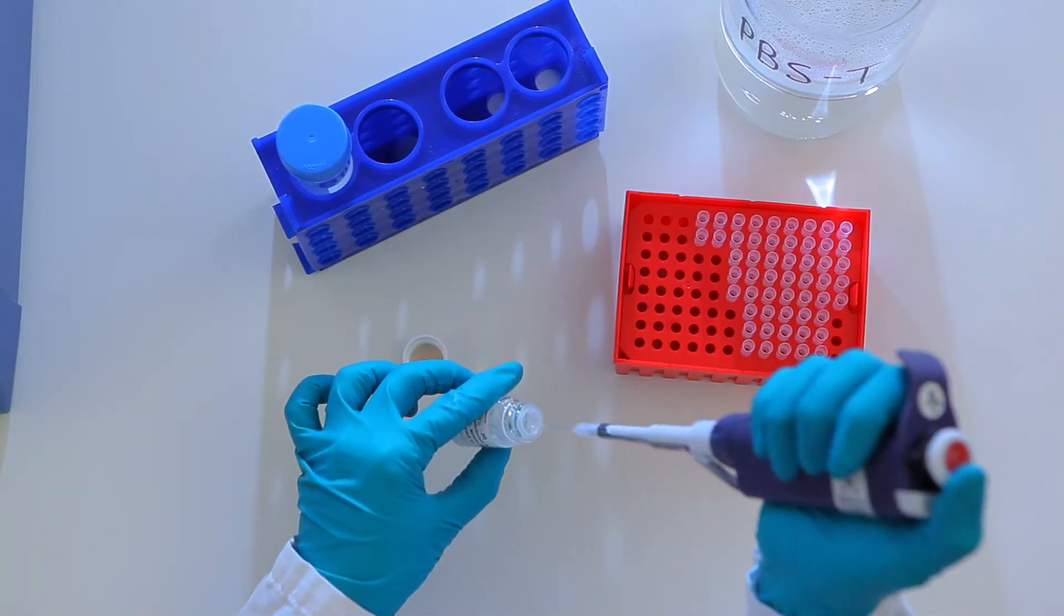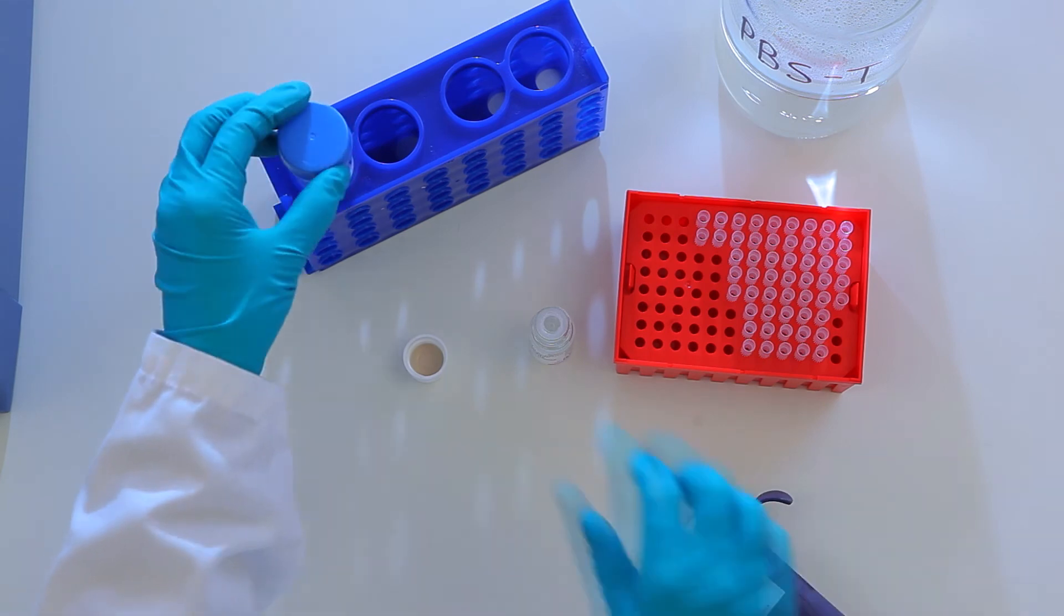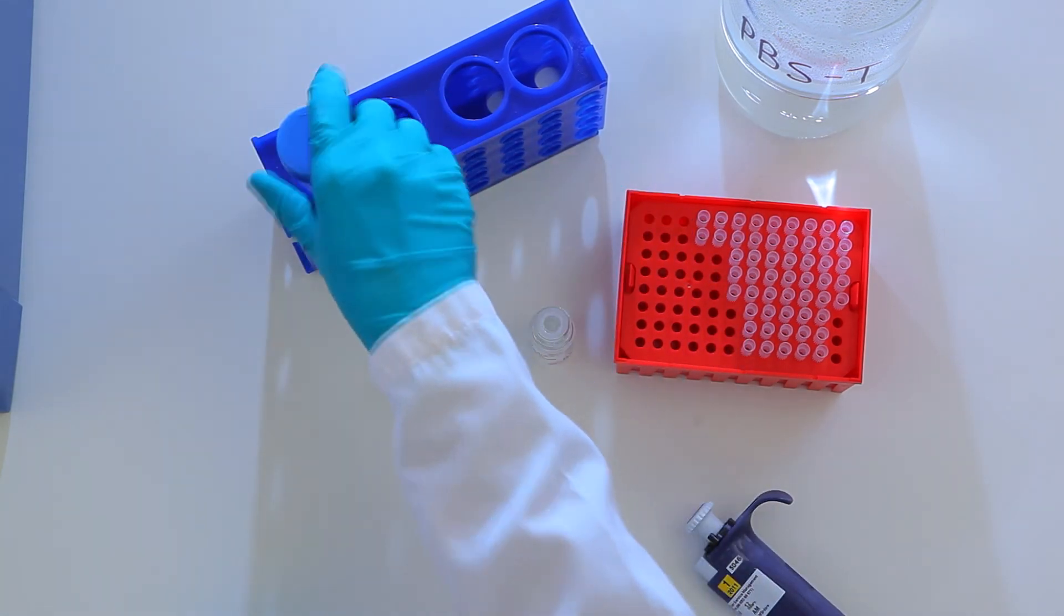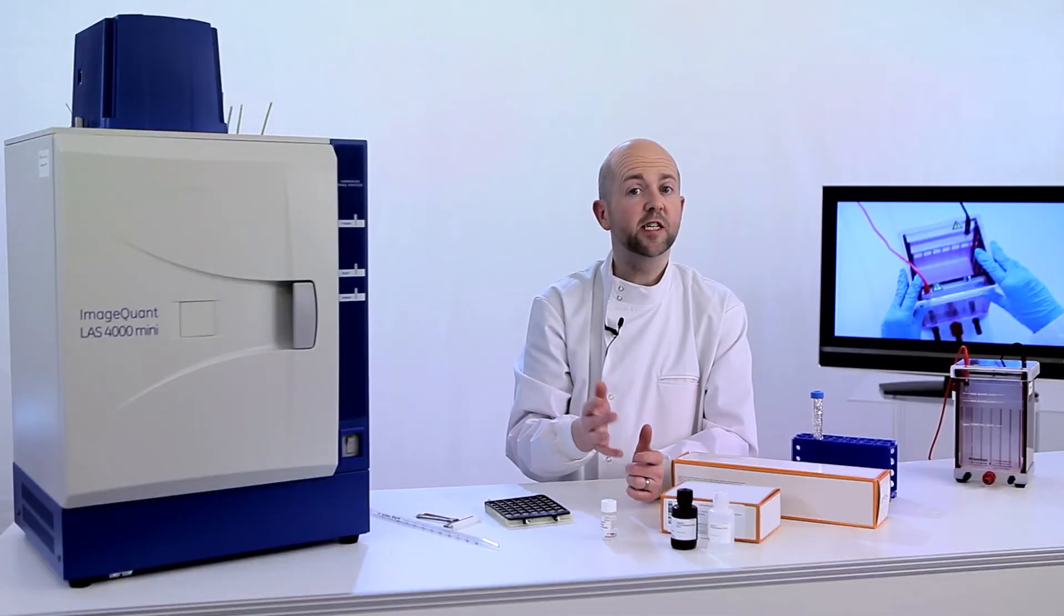After incubating the membrane in the primary antibody for one hour at room temperature, the membrane is incubated in an appropriate HRP-labeled secondary antibody. When using ECL prime, the secondary antibody can be diluted in the range of 1 to 50,000 to 1 to 200,000.